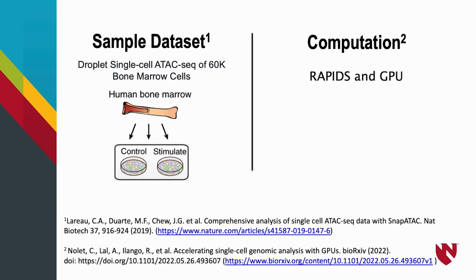Rapids pipeline is a set of open-source libraries and frameworks that allow for fast and efficient data processing and analysis on GPUs. It is designed to accelerate data science and machine learning workloads by leveraging the power of NVIDIA CUDA-enabled GPUs. Utilizing GPU technology in the Rapids pipeline drastically reduces processing time, cutting it down from days to just hours. The Rapids pipeline includes libraries for data manipulation, data visualization, machine learning, and deep learning. It also includes tools for data loading and to perform extract and transform operations, allowing you to easily move data between different stages of the workflow.